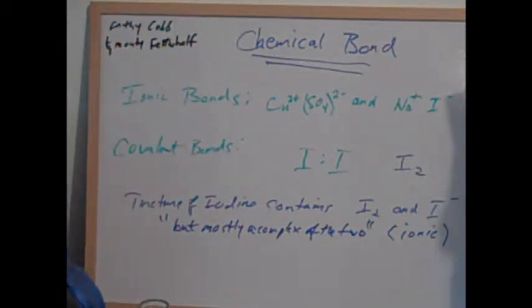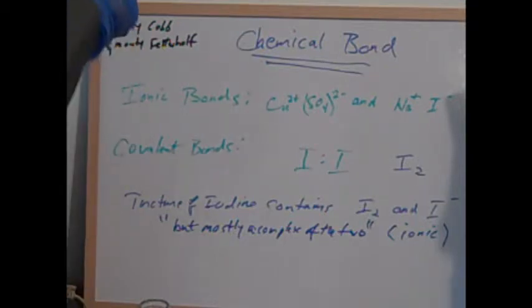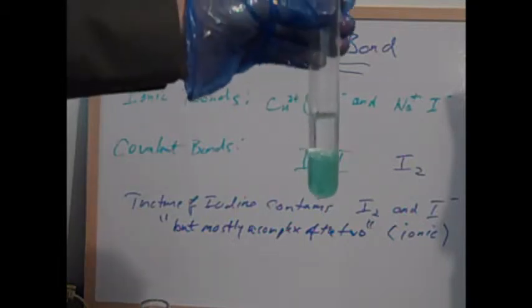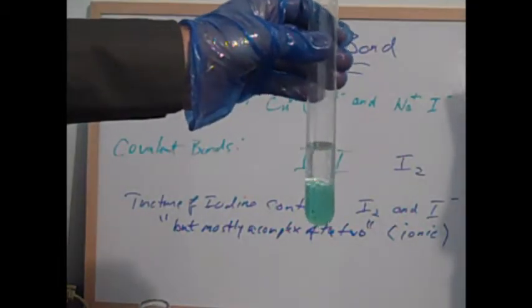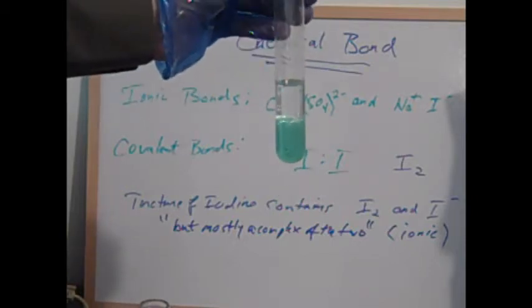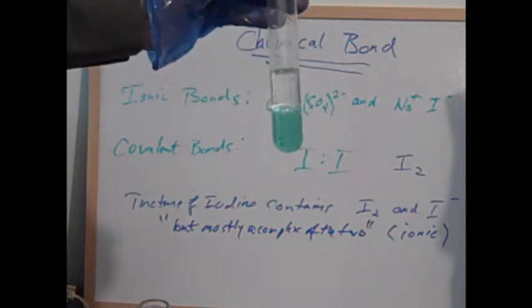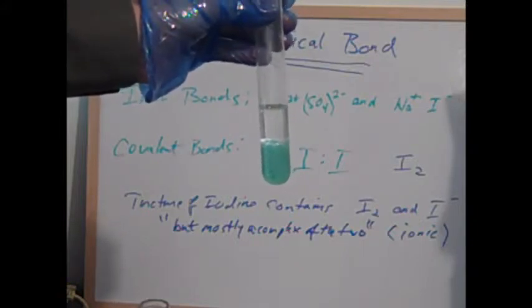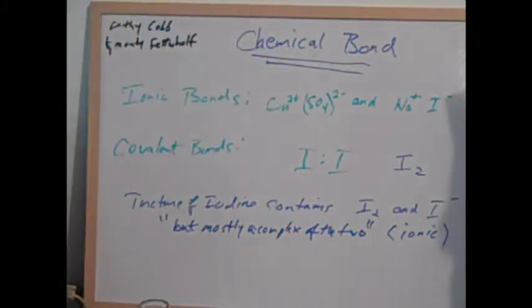A little bit more copper sulfate. As you see, before we even try to mix it, the copper sulfate stays at the bottom of the tube. It's slightly heavier, slightly denser than the mineral oil, and they form two separate layers. The mineral oil is clear up top, and the copper sulfate is a light blue color on the bottom.